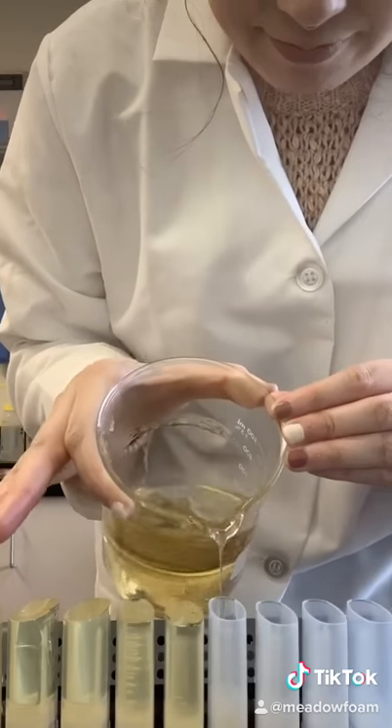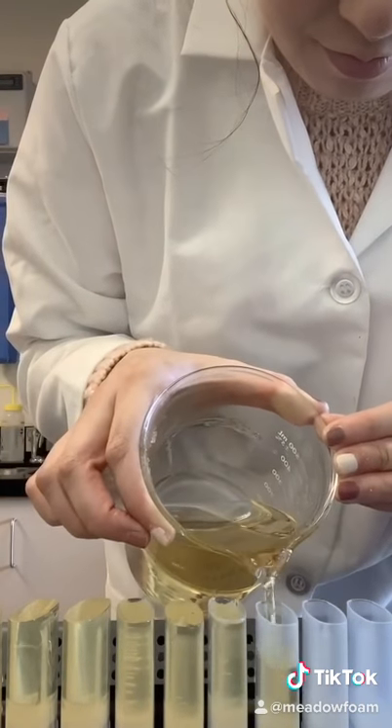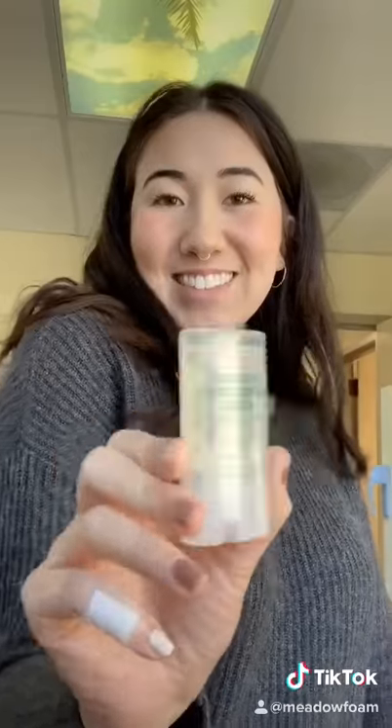The formula started to cool and solidify, but I just put it back onto heat to melt it down before pouring it into molds. I did spill a little bit, but I'll clean it up later, and after that this batch is done.